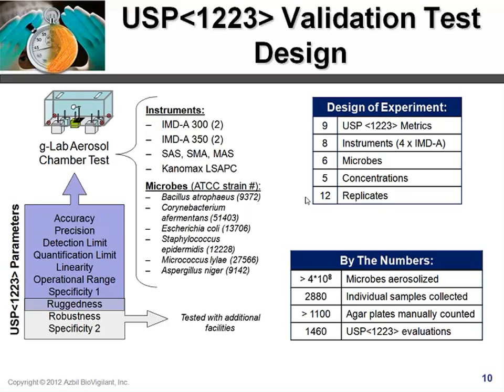So the scope of this testing was pretty massive. We collected over 1,000 agar plates in the final test, from which over 1,400 comparisons to the 1223 metrics were performed.